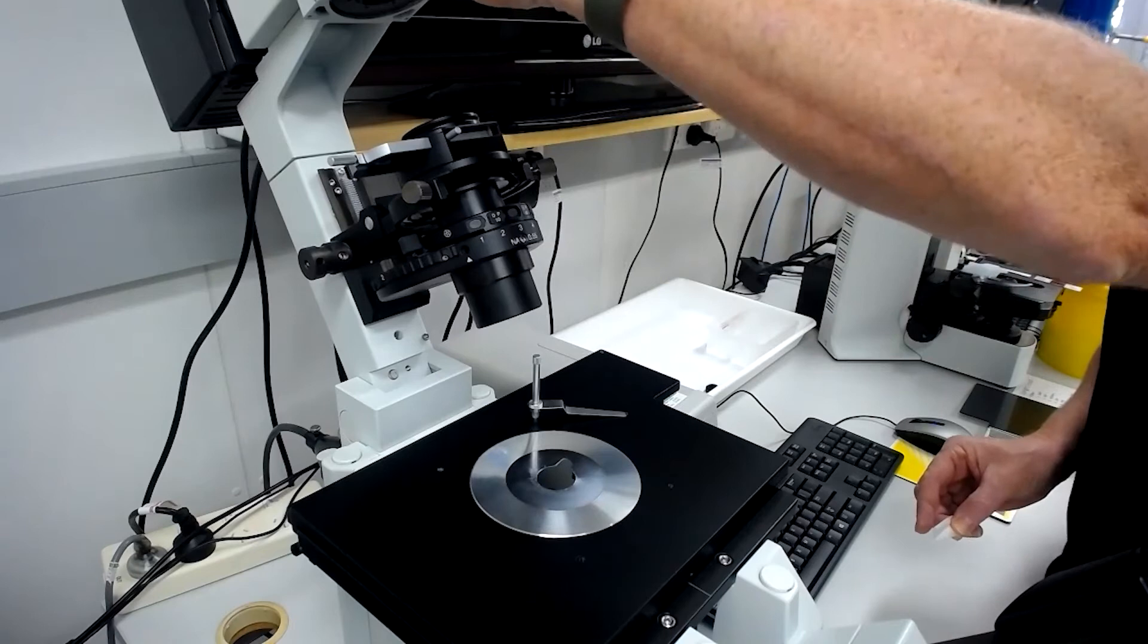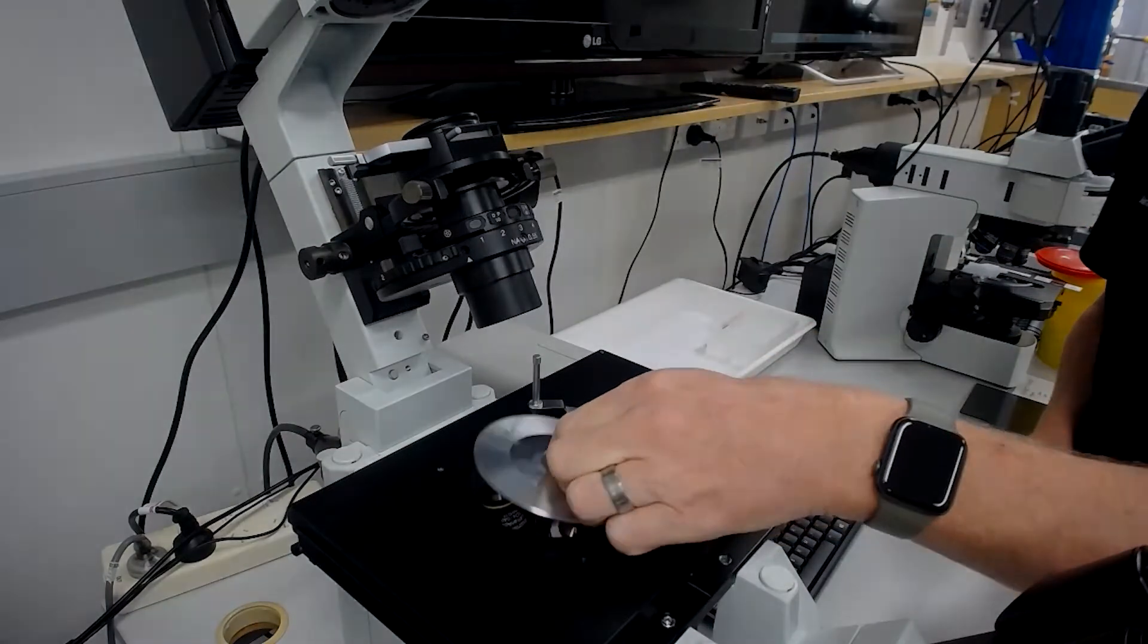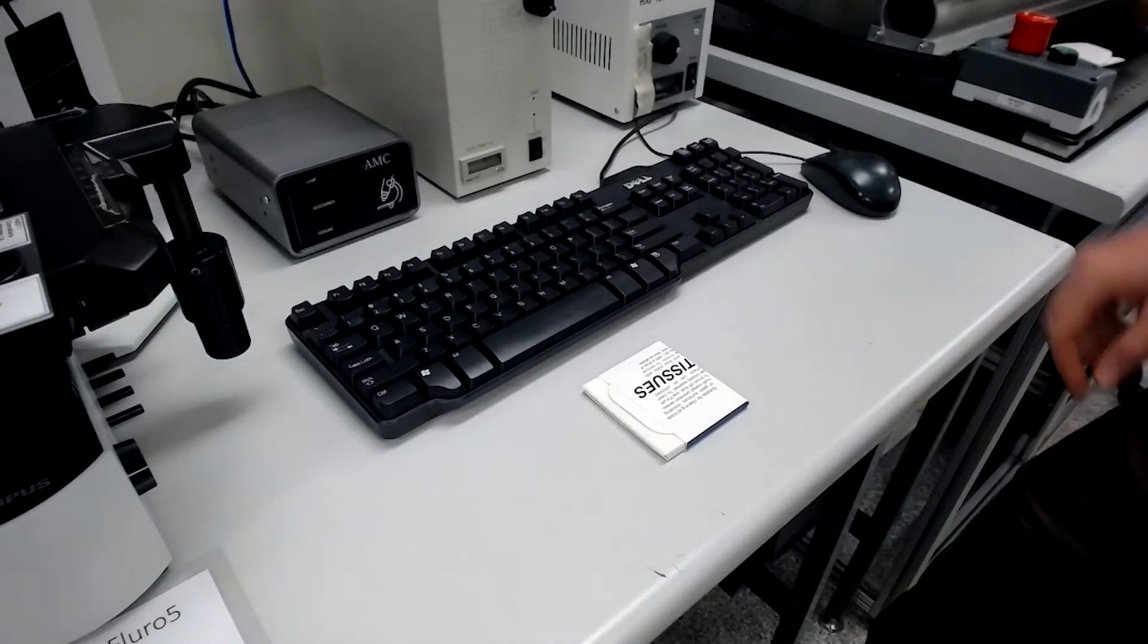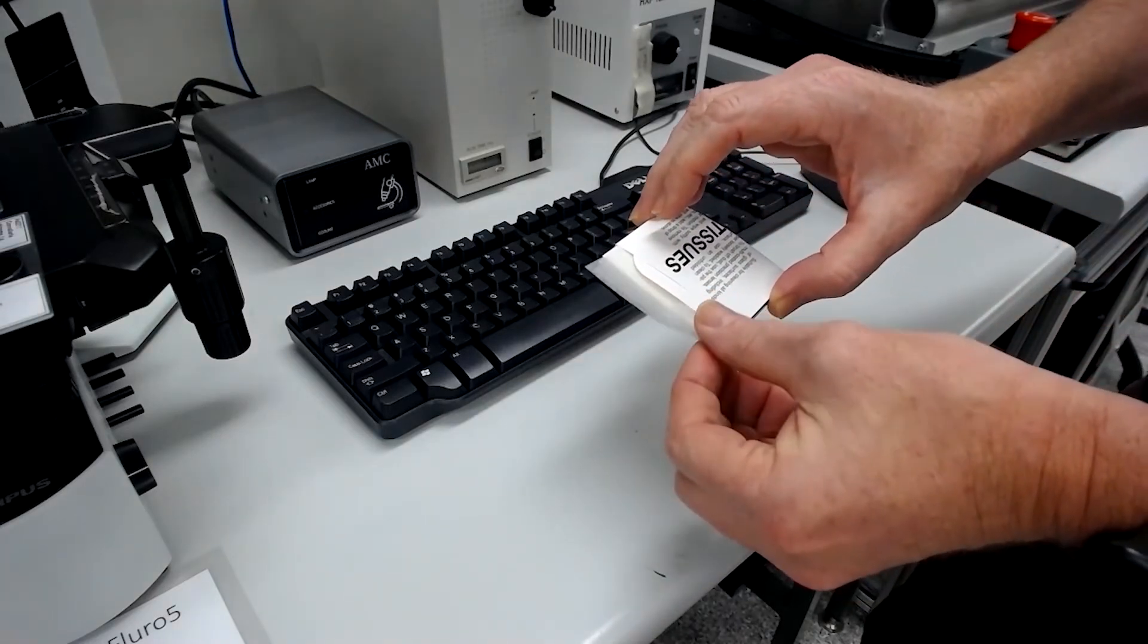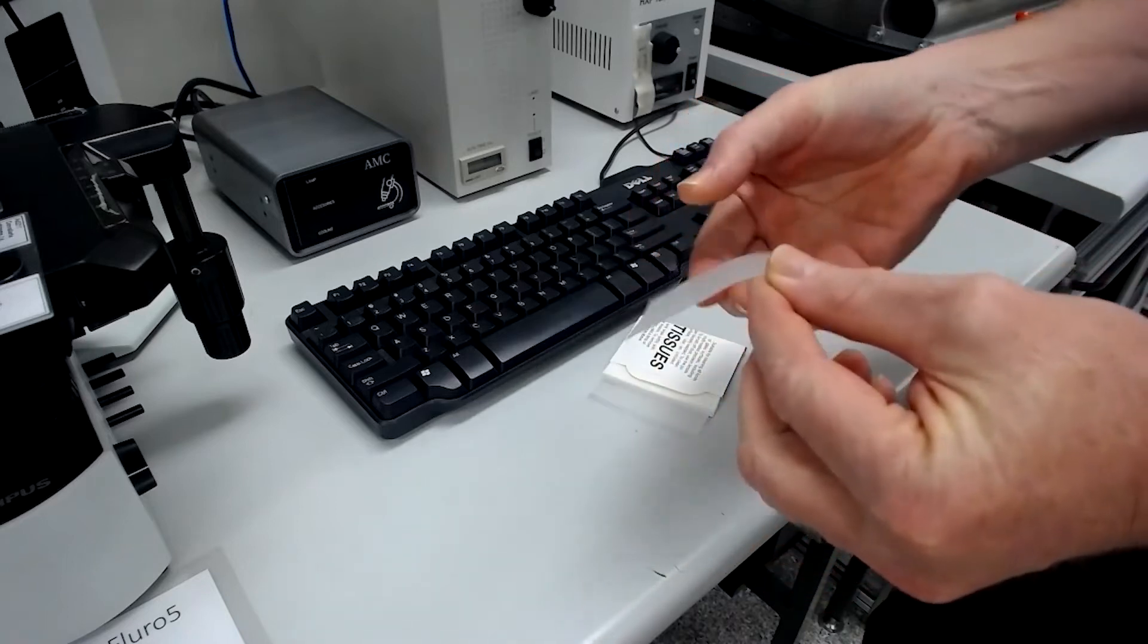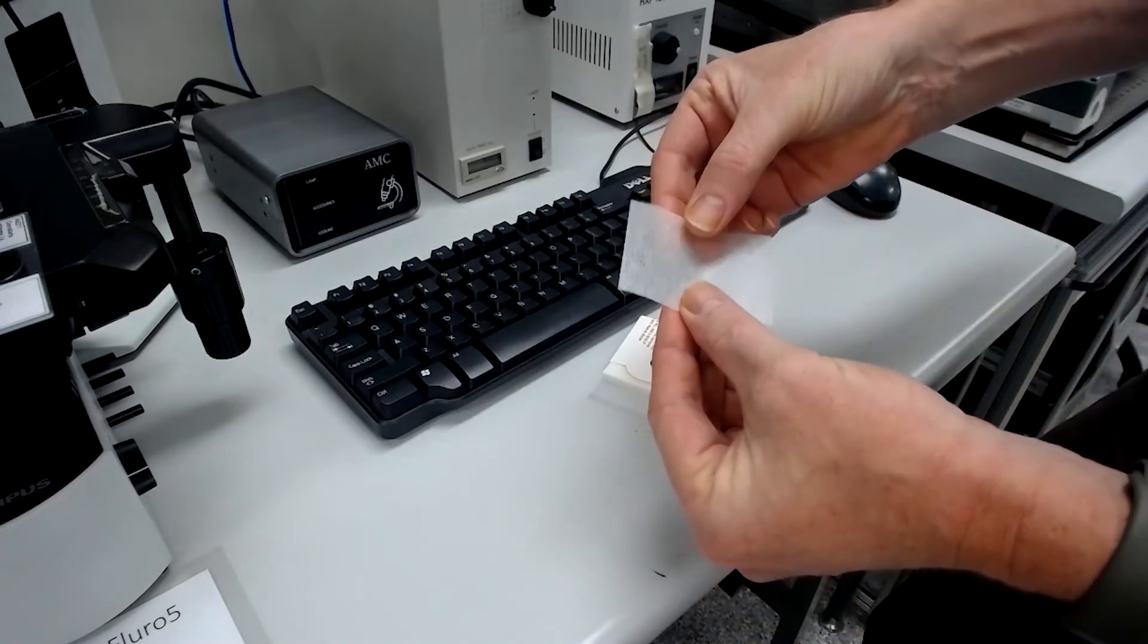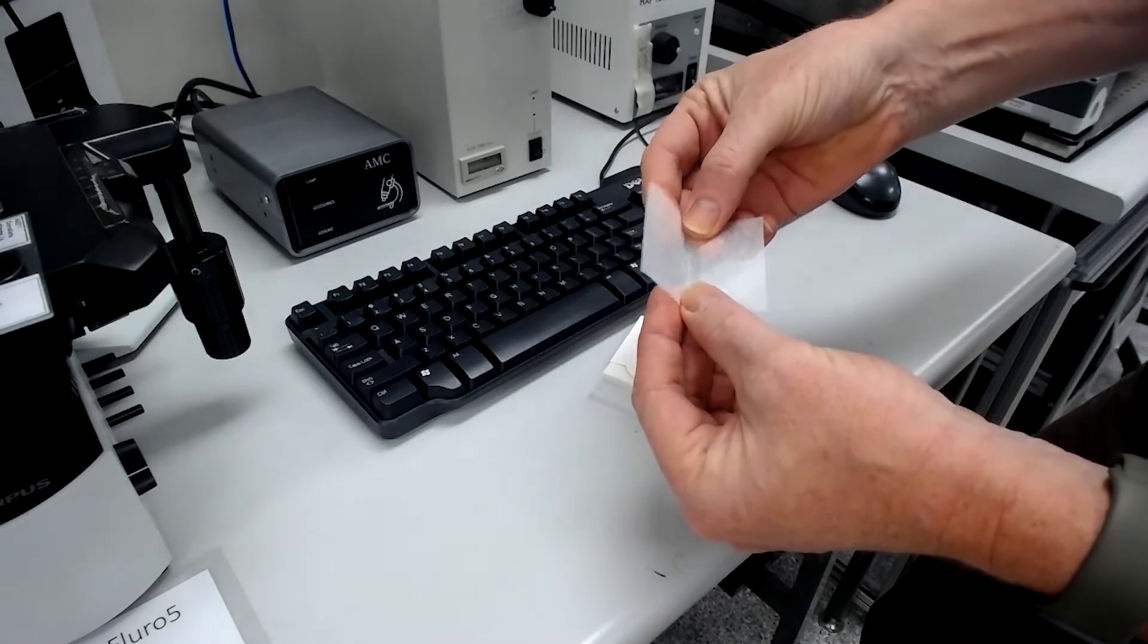To prepare for imaging, clean all the objectives. Take a piece of lens tissue from the box and only touch the tissue along the edge, being careful to not transfer oils from your finger onto parts of the tissue that will be used to clean the objective.